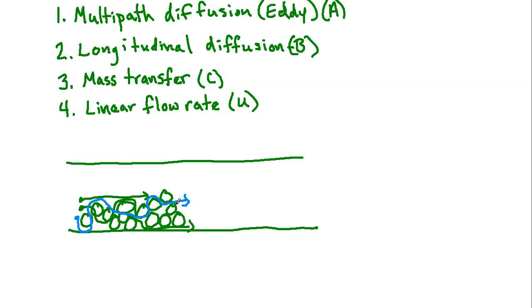So it's a bit counterintuitive to say, oh, I'm going to do chromatography and I'm really just going to let these guys separate out without a whole lot of packed material in there or any sort of intermolecular force interactions going on in the column. So in theory, A could drop out, but in reality, you're probably going to be dealing with the multipath diffusion factor to some extent. All right.